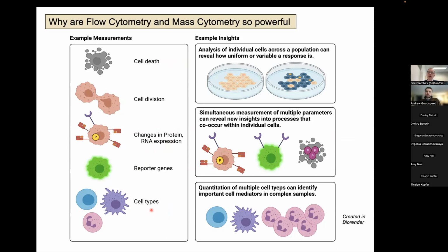So there are hundreds of different ways in which you can use these technologies. A few common examples. In this top right panel, we're looking at a case in which cancer cells are treated with either a vehicle or a chemotherapy. And you can use these technologies to assess how individual cells are responding across that population. For instance, if there are cells which fail to respond, those in tan, versus those that respond to the chemotherapy. This can allow you to really understand if there might be resistant cell populations within the bulk population.